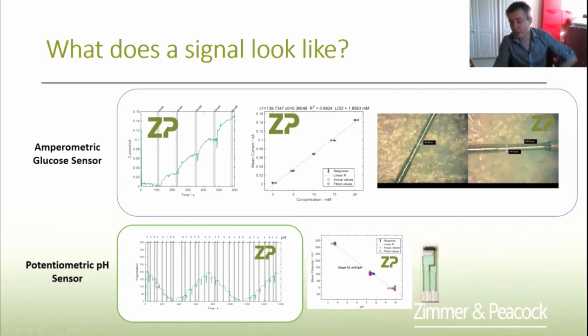So when you're calibrating a pH sensor, what you're effectively doing is, the meter says, what's the pH of the solution? You say pH 4. So you put the pH 4 in there and it measures the voltage. It says, oh, that voltage is 175 millivolts. Then it says, put in another solution. So you put in another solution and it's pH 9. So now it goes, okay, that's a pH 9. I've got 0 millivolts. So now it's able to do what's a 2-point calibration.